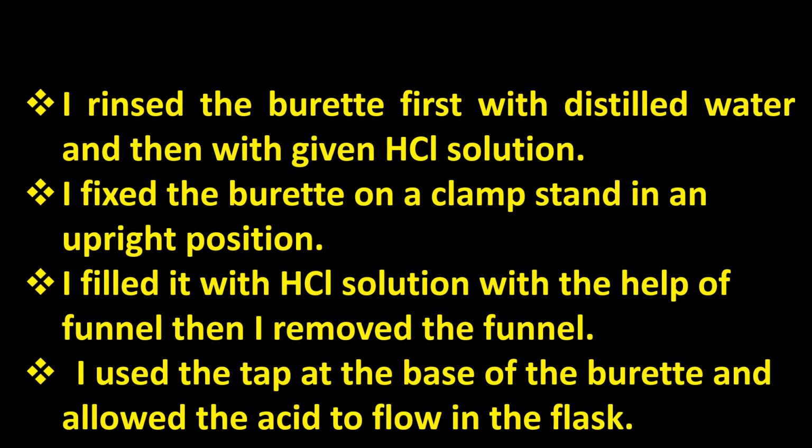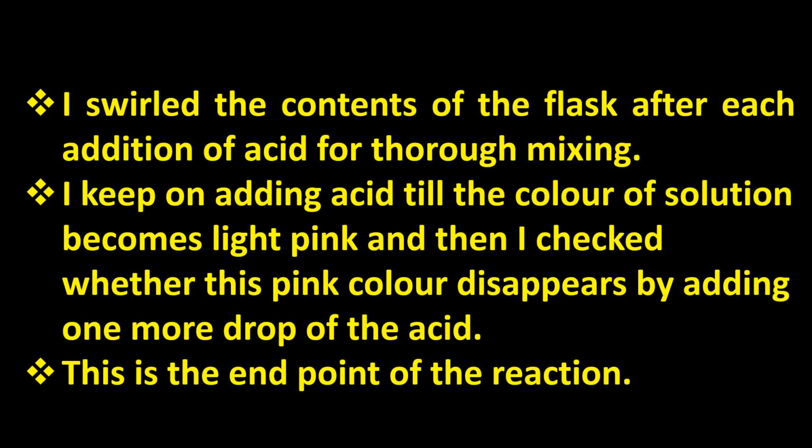I have to allow the acid to flow carefully and slowly so that I can easily find out the reading. Please remember, when you are adding the acid into the base, never forget to shake the flask. When you are adding acid into base dropwise, always shake the flask for proper and thorough mixing. I keep on adding acid till the color of the solution becomes light pink.